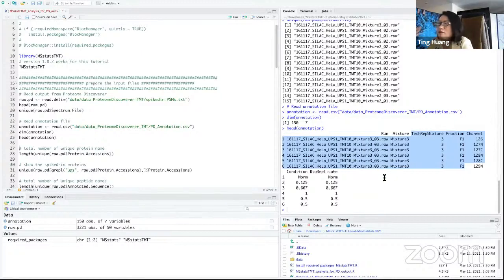In this tutorial, I will first assume that we already have the 2 input data, the intensity file and annotation file, and then we will go through the analysis. In the last part, I will use half an hour, because that is actually the first and maybe also the biggest difficulty most users face when they use MSstats: how to prepare the annotation file.